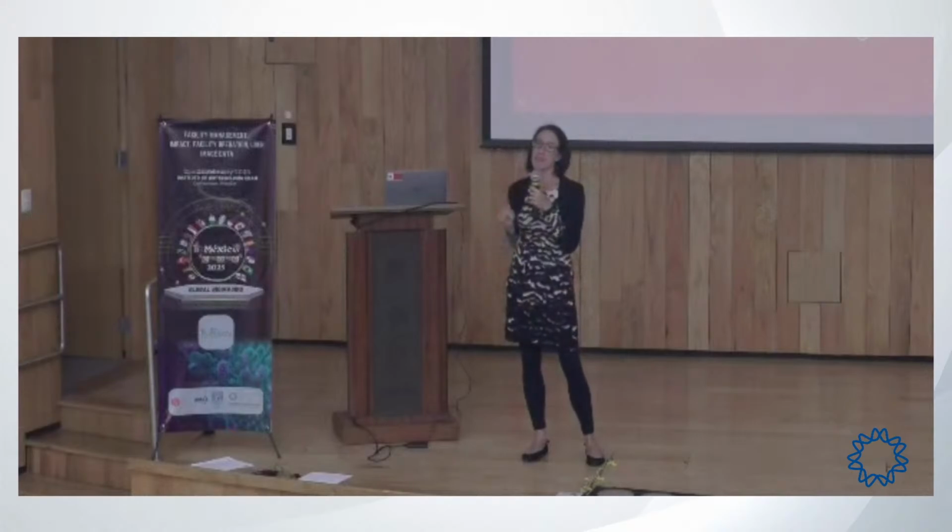So that's something I highly recommend: if you have access to a mass spectrometry core, try to combine both. This is what we call integrative structural biology, the toolbox of structural biologists like me. Never use only one technique, use as many as you can. And mass spectrometry can be super helpful for that kind of protein.